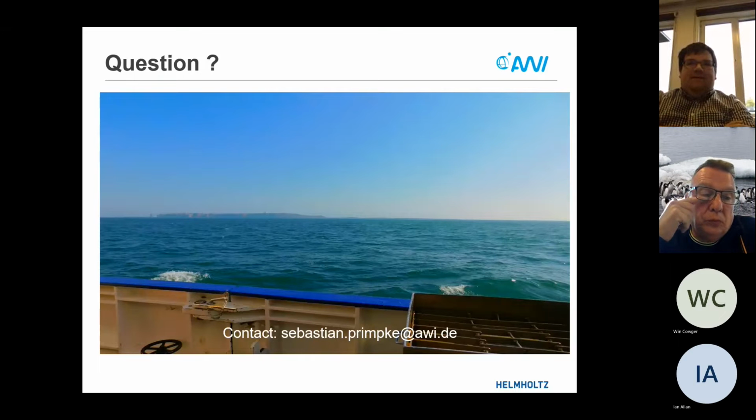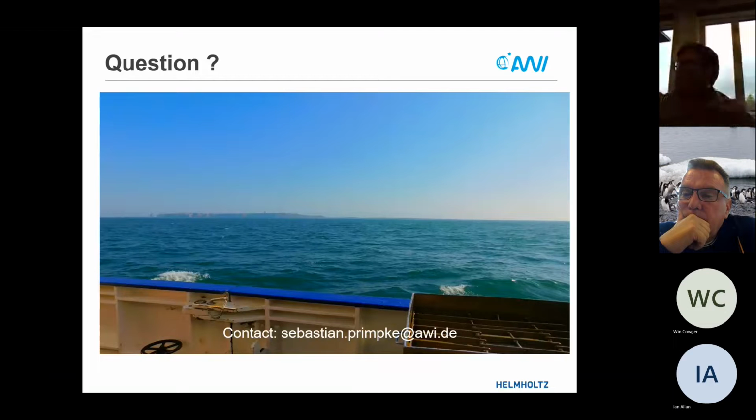Yeah, I think it's definitely something that needs to be spoken about more. And I think it's something that Rachel and Chiara, as an example, have been exploring with polymers, going into more detail. And I go, just trust the database, trust the database. We don't have the time to explore it further.